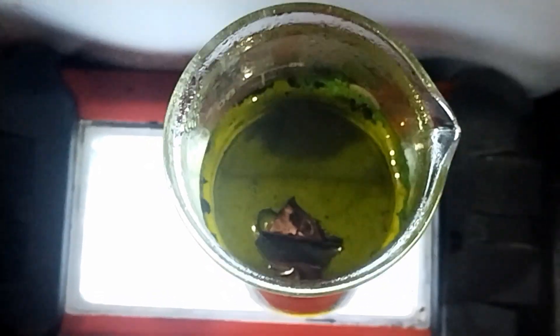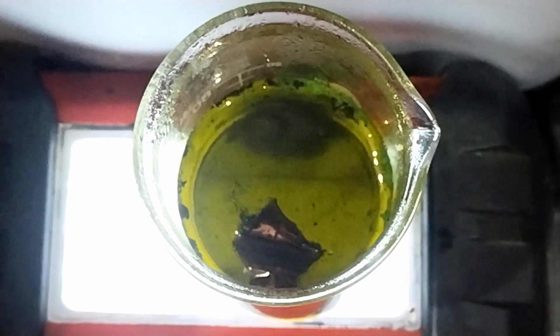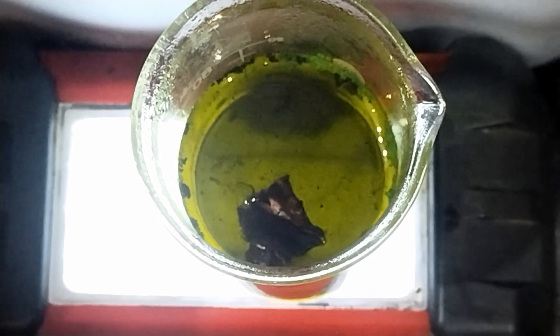The reaction keeps going as more copper dissolves. If we left it for long enough, the entire foil would disappear.